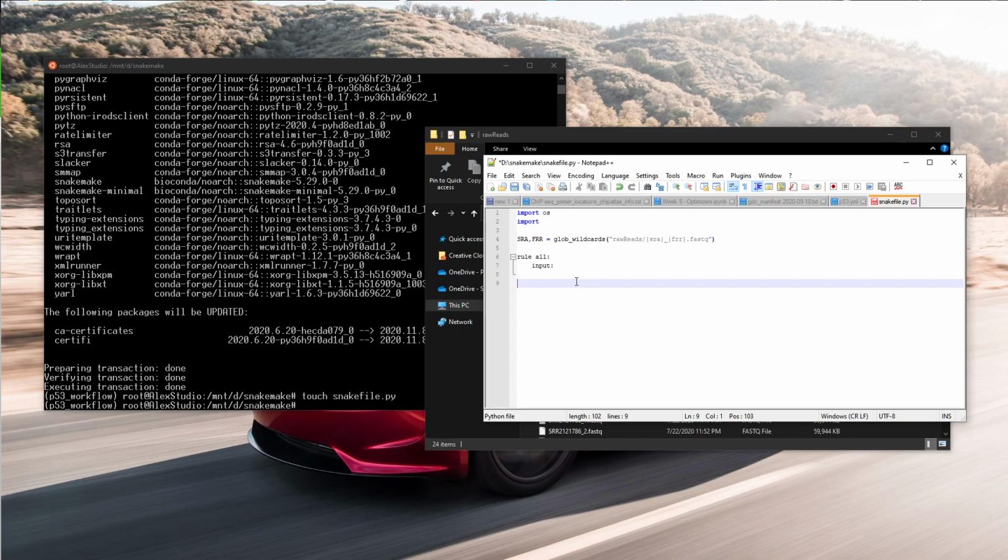The first thing we want to do is run FastQC. So we can do raw FastQC as a rule. For our rules, we'll have things like input, like with rule all. We'll also have our output. And in the case of this QC, we're going to have to put our output here into the input of rule all, otherwise it won't run the raw FastQC.